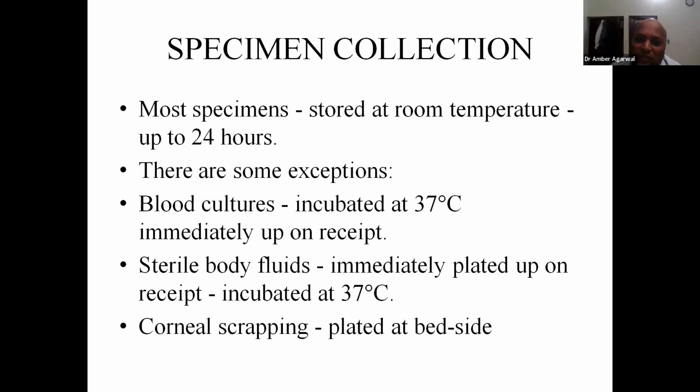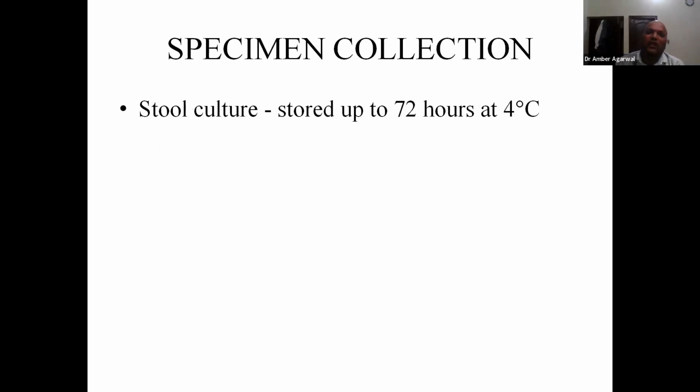Again, sterile body fluids: we are putting sterile body fluids in our automated blood culture bottles for better results. Now, corneal scrapings, they say it should be plated bedside. Bedside means you can send your blood agar to the ophthalmologist when they require it, and then they can plate it at the bedside. Stool culture, they say that it can be stored up to 72 hours at 4 degrees.